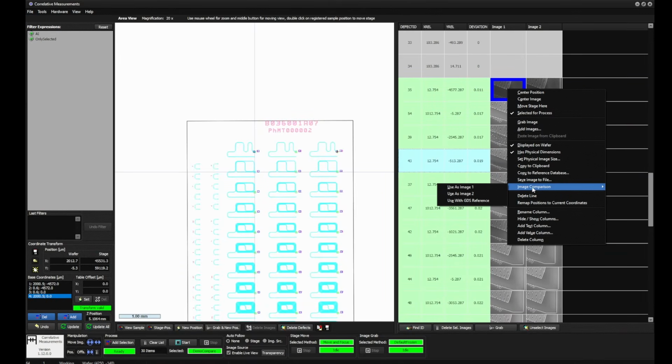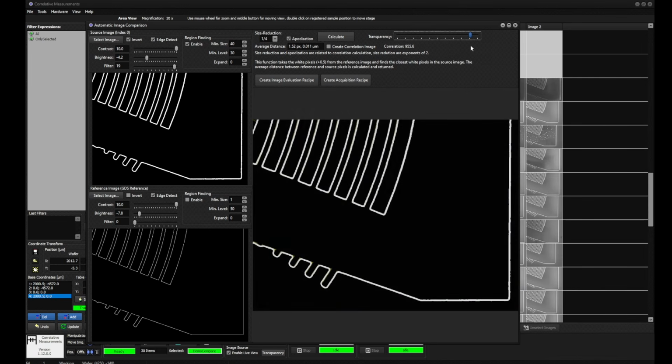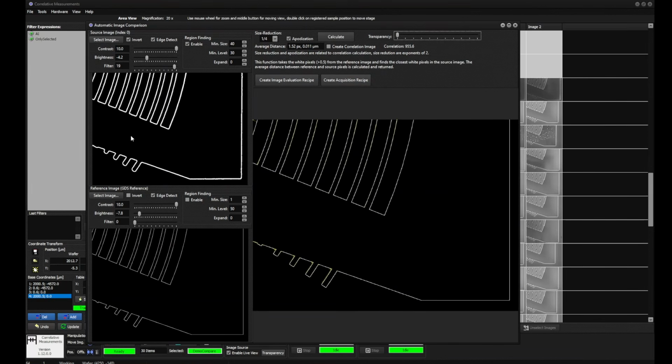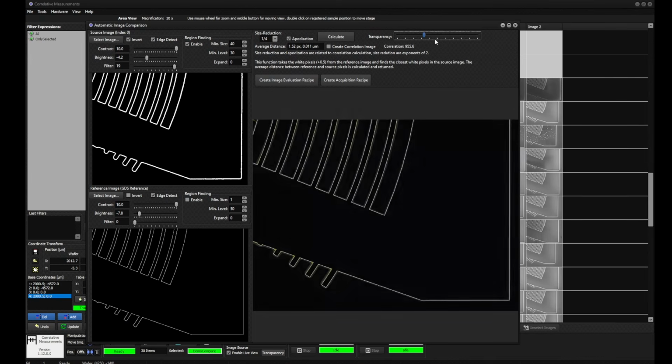Why is this so good? Let's have a look at it. And we do some calculation. Yeah. This really matches as good as it can be, because it's a line width caused by the filtering that causes now and the pixel nearly overlap, so that we have nearly no deviation between these.